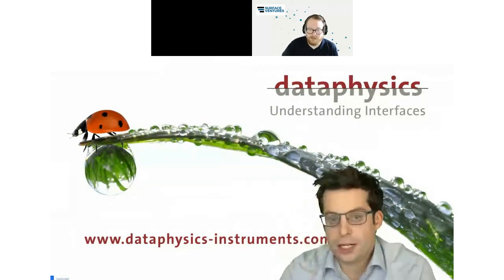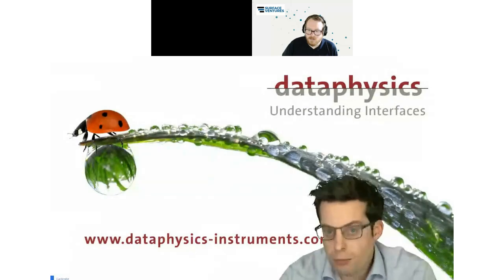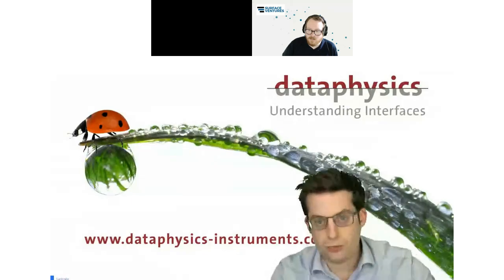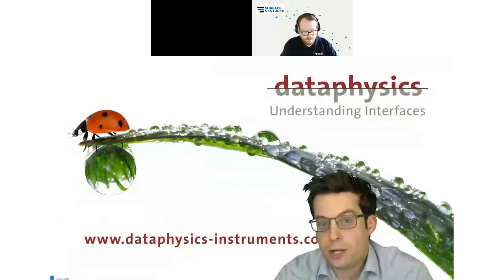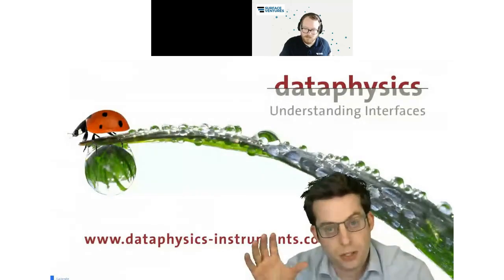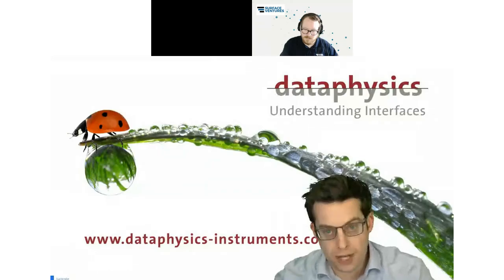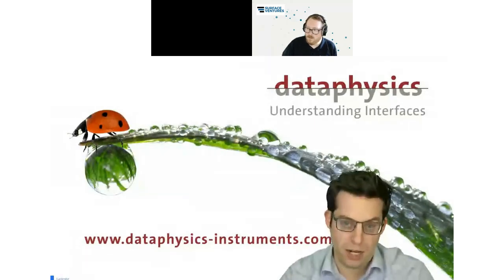Yeah, only one little comment. Measuring single fibers is possible only if the fiber is very stiff. So this means carbon fibers, glass fibers, no problem. But if you have organic fibers, like in my shirt, for example, they have a lot of OH groups on the surface. If you submerge them in water, these fibers swell and bend. So typically organic fibers you have to measure as a bundle, because then it does not matter. But with synthetic fibers like glass fibers or carbon fibers, you can still do single fiber measurements.